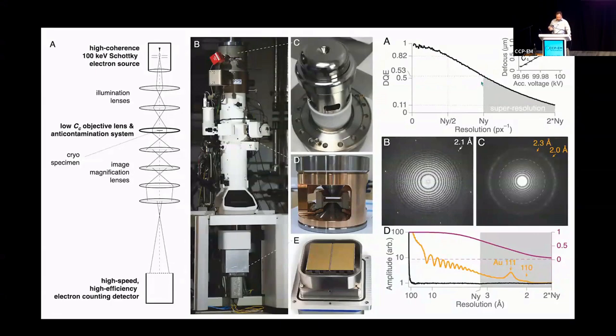And you can actually tell to a quite good degree where in the pixel the electron hit by using this additional information. And this is partly due to the very high efficiency of the detector, and also Greg's new counting algorithm, which he implemented on this to enable us to get the maximum amount of information out of each electron event.